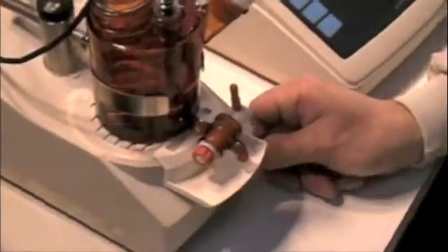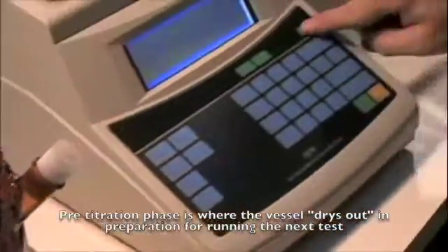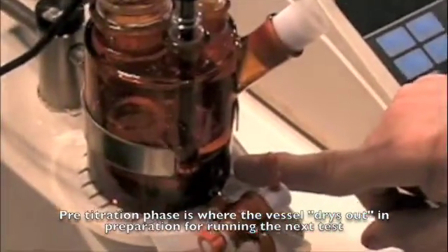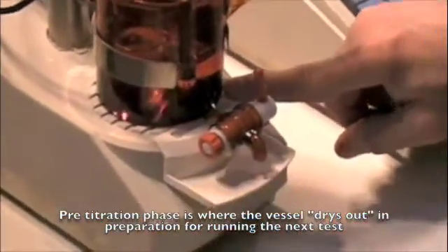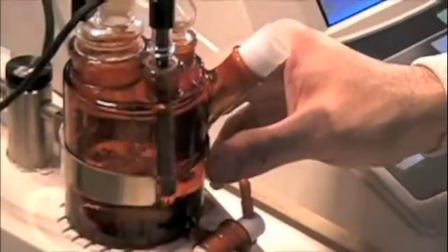At this point, we can go ahead and begin a pre-titration phase. You'll notice that the stir bar starts to stir and the instrument begins to take out the moisture inside the vessel.